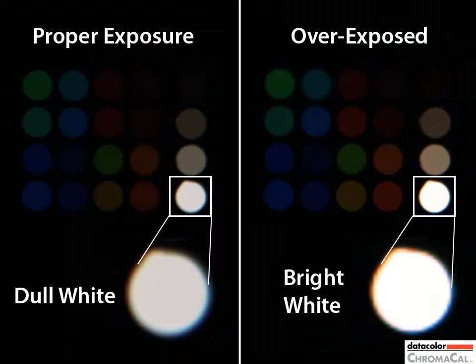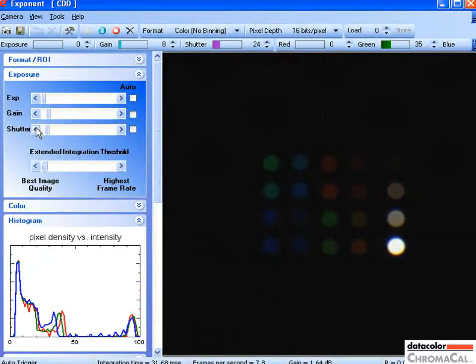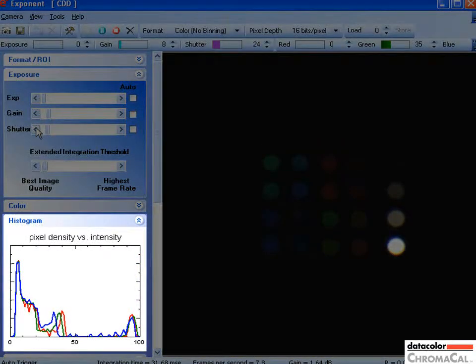Note that it's important to keep your eye on the white spot to see when it becomes slightly gray. Keep in mind that you can err on the side of underexposure without any effect on the integrity of the calibration. And, by the way, if you're comfortable with histograms, a properly exposed calibration slide should have a histogram which generally looks like this. The entire histogram is within the camera's dynamic range, with the peak at the right end representing the white spot.